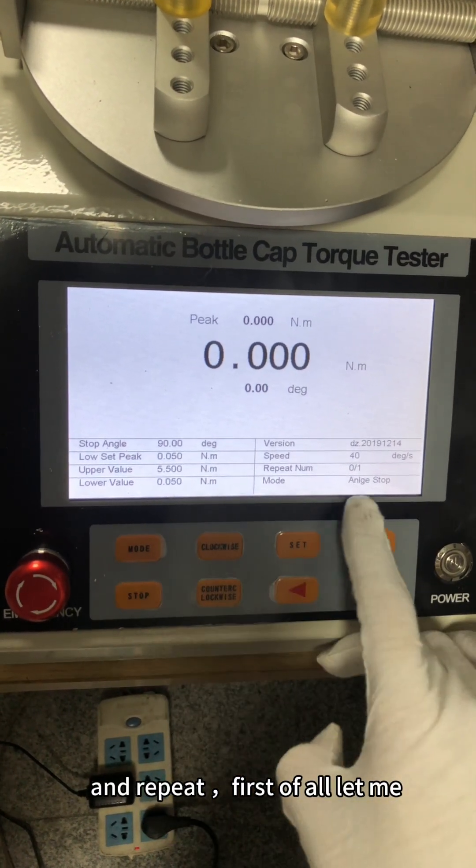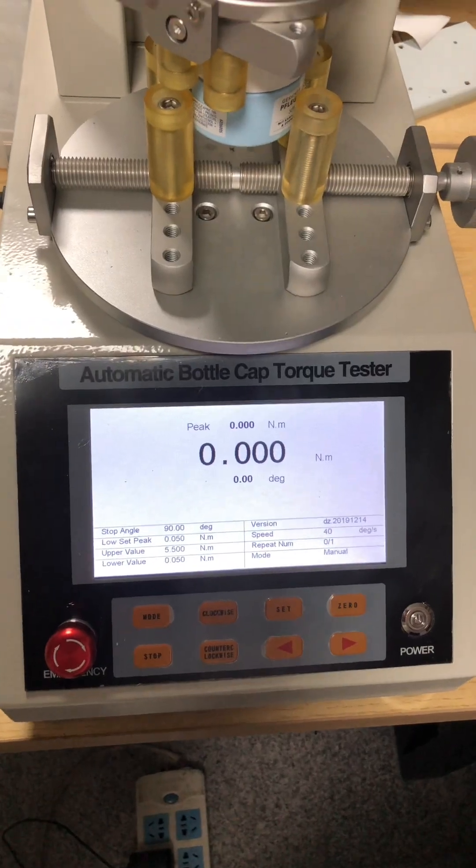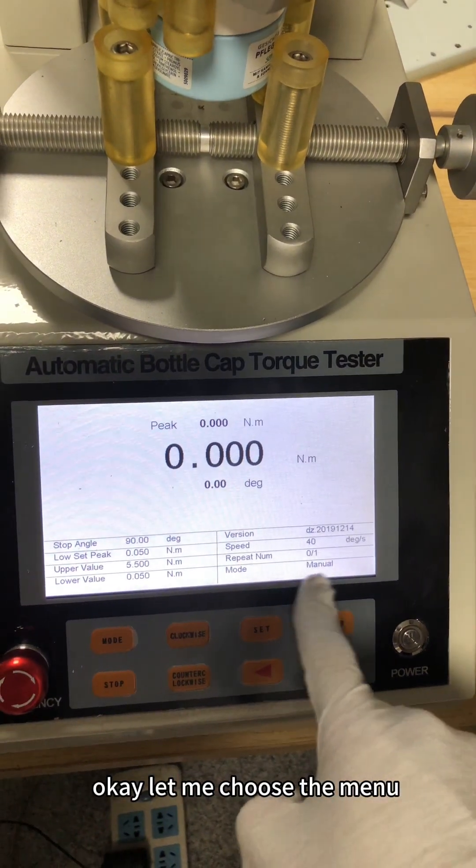First of all, let me choose the menu model.